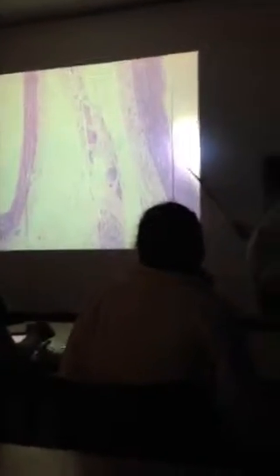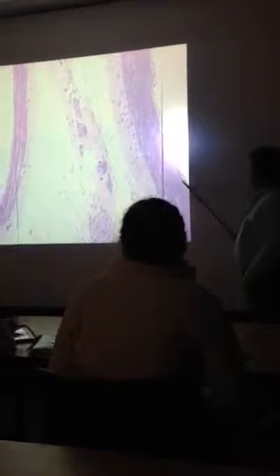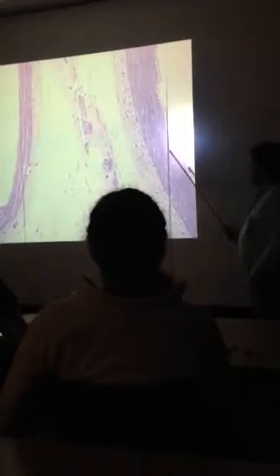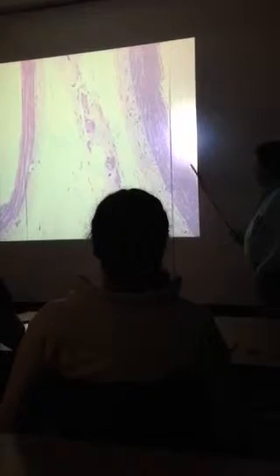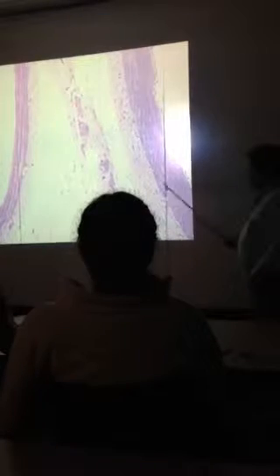Okay, here, this is the artery. Notice how the tunica intima is scalloped. Again, sometimes you can find the nuclei pushed out in the lumen. I saw lots of people draw these kinds of figures. This is the tunica media, again, with variable amounts of smooth muscle and or elastic fibers. And here's the tunica externa.